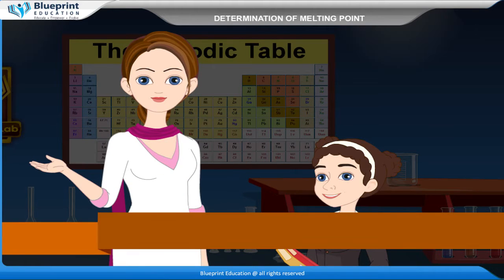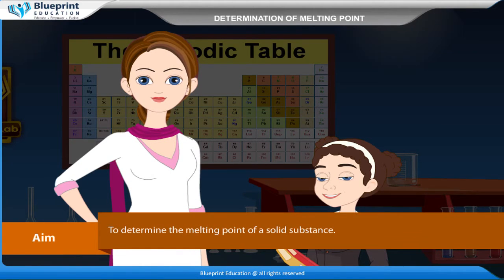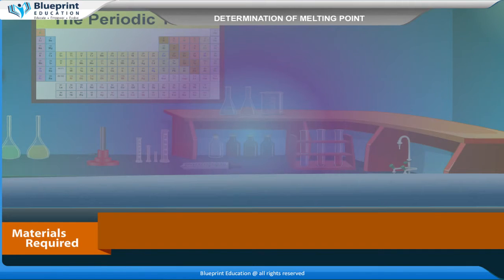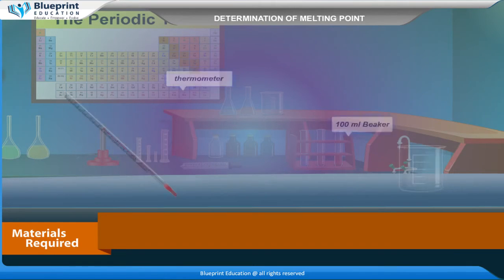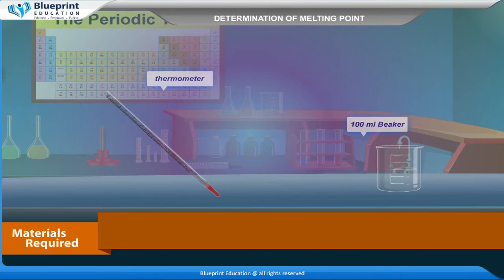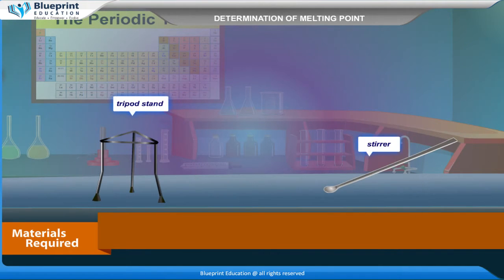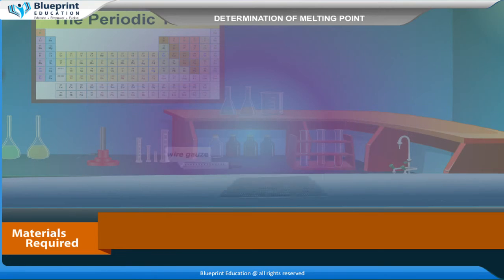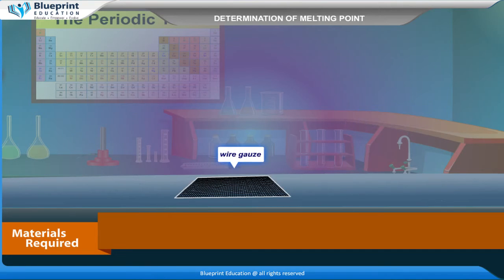Aim: To determine the melting point of a solid substance. Materials required: Thermometer, 100 ml beaker, tripod stand, stirrer, thin-walled capillary tube, heating medium — water or paraffin, wire gauze, etc.